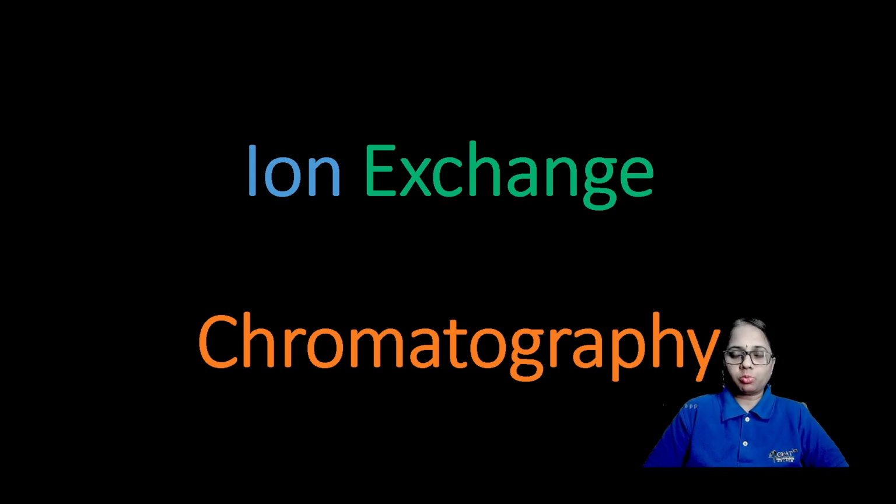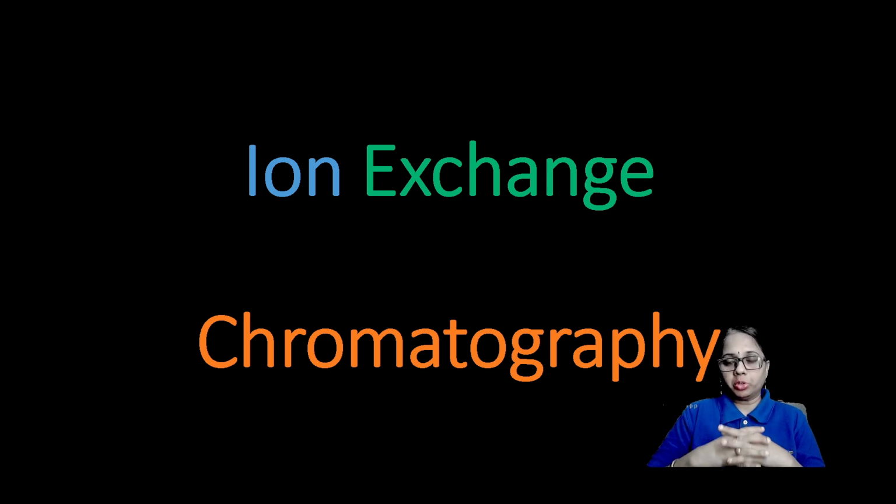So in today's pharmaceutical analysis session, we are going to discuss ion exchange chromatography. In chromatography, there are many types of separation techniques available. In today's session, we are going to discuss how ion exchange takes place and how it is useful to us in pharmaceutical applications or any other applications.